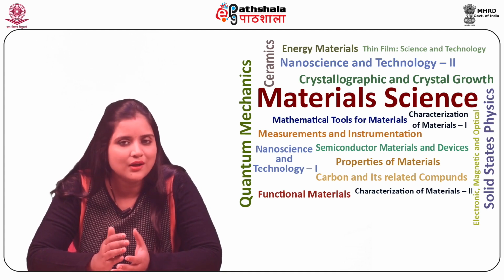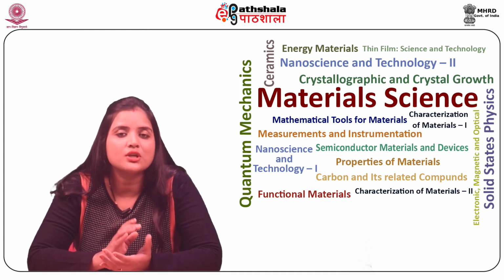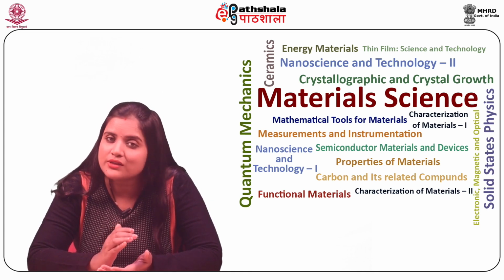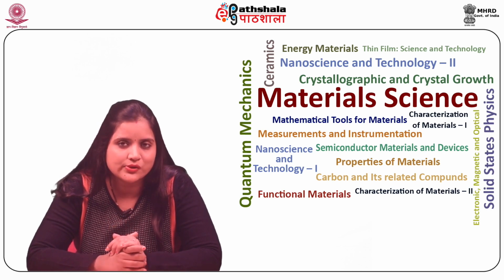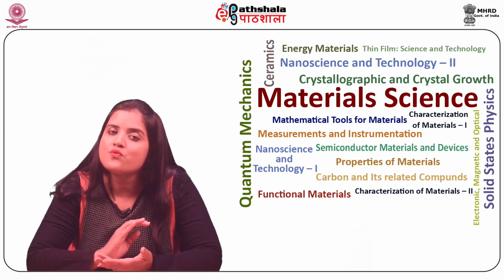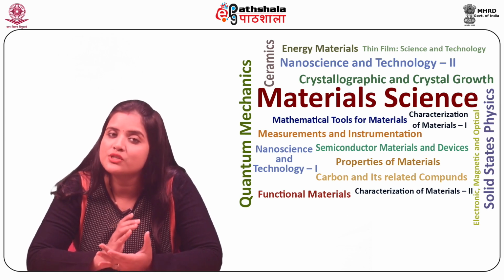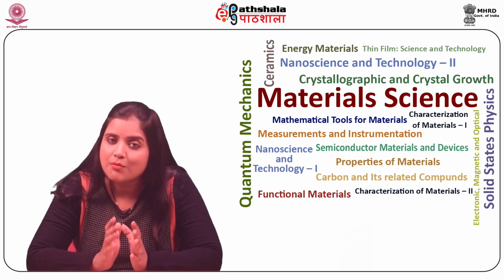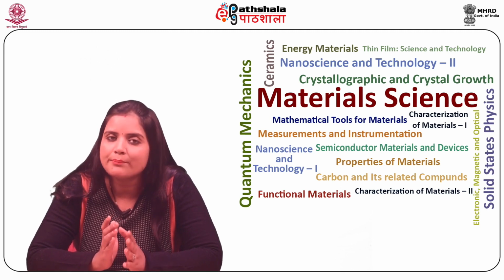Numerical algorithm can be used to reconstruct the object image. Hence, a computer algorithm replaces the lens used in traditional microscopy to construct the image. The information of the object is fed to a digital image sensor, that is, photodetector, and the image of the object is reconstructed by the computer.